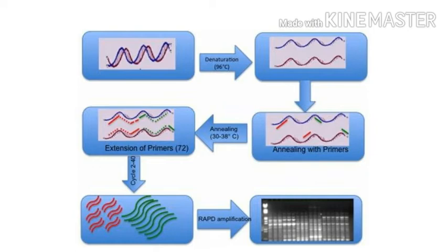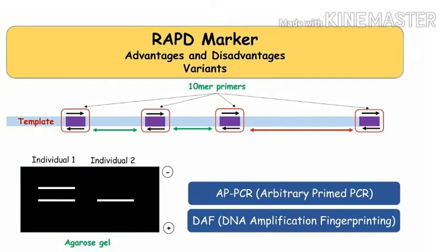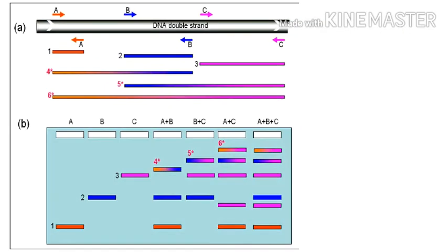Given any particular 5-base sequence, such as ACCGA, how often will this exact sequence appear in any random length of DNA? Since there are 4 different bases to choose from, 1 in every 4 to the power 5 stretches of 5 bases will, on average, be the chosen sequence. Any arbitrarily chosen 11-base sequence will be found once in approximately every 4 million bases.